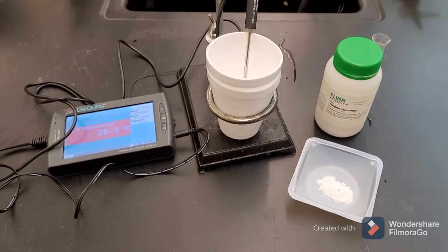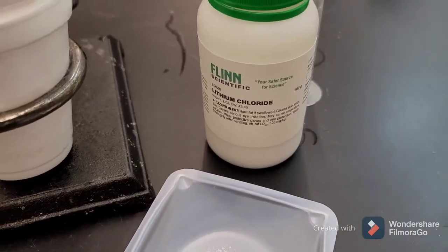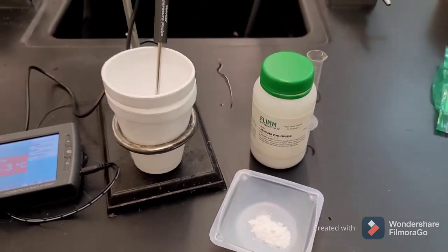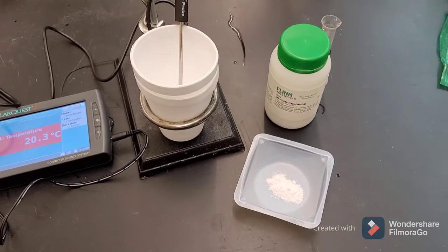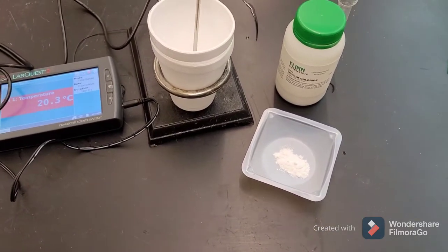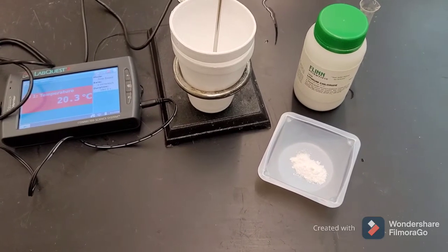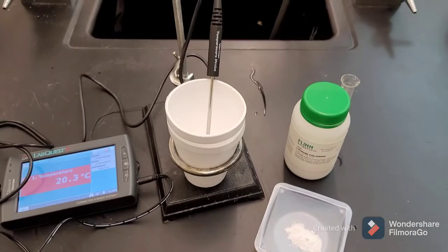Okay, I'm going to do the same thing, but with a different chemical. This time I have lithium chloride. Again, it's one of the chemicals, if you've read your lab, that you're going to use for the experiment. They have a bunch of data there in that table that you need to look at. You'll be looking at that data on your table to figure out some kind of rule to predict if the chemicals are going to be endothermic or exothermic.